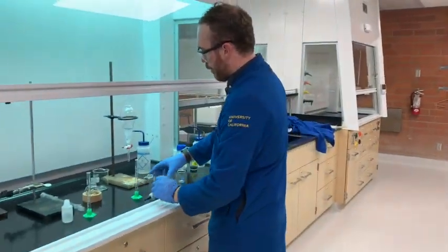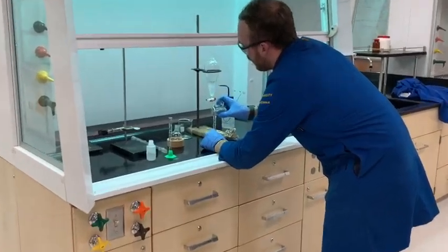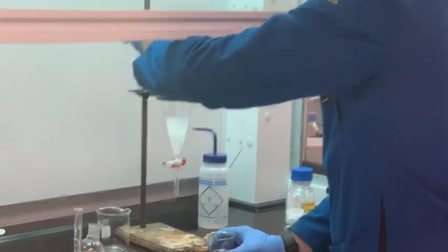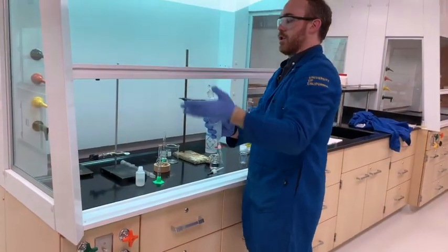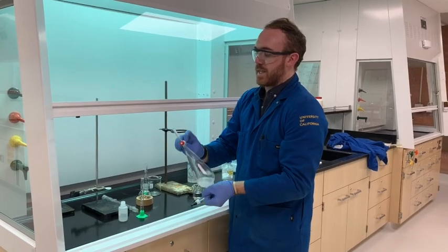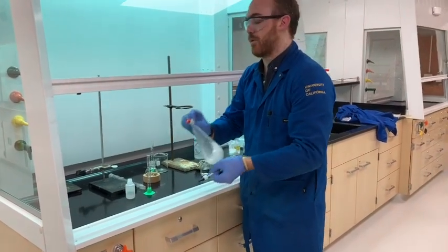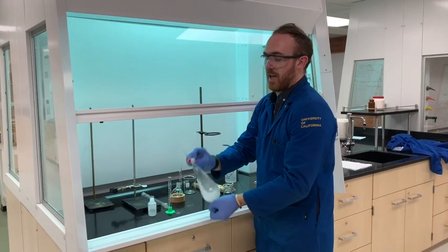I poured myself some DCM ahead of time, and we're going to use two 15-milliliter portions. Pour it in and now we begin the separation. As you shake, make sure that you place your palm on the stopper, turn it upside down, and allow it to vent as you shake. The mixing can potentially release a little bit of energy, and the warmth of your hand can heat up the solvent — especially DCM, which is pretty volatile. You always want to be releasing the gas; otherwise it's going to blow out the stopper on the bottom and you're going to have a huge mess on your hands.